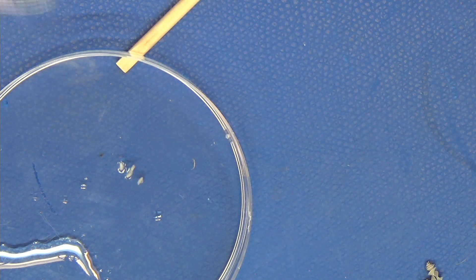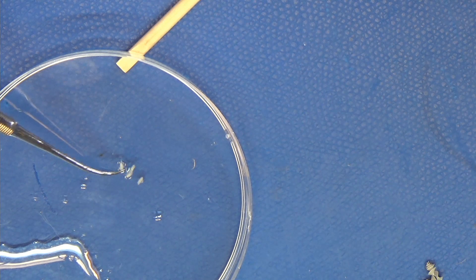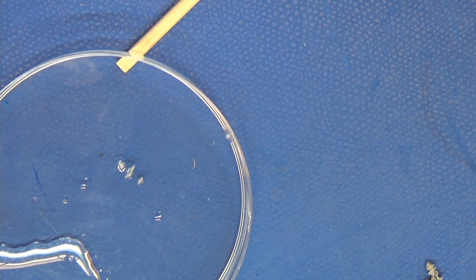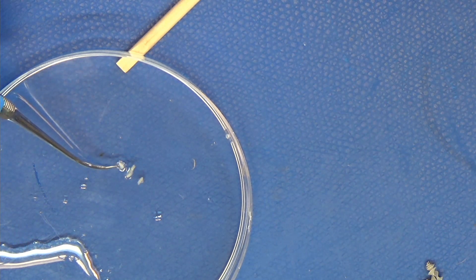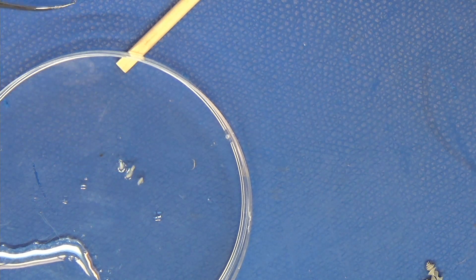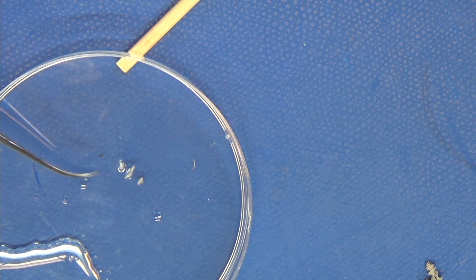I've had these root tips soaking in hydrochloric acid for ten minutes and then I've rinsed them off in a different container. This is the rinse water off to the side, and if you look at these, you can see they look a little mushier — they've been digested a little bit. So now we're going to hit them with some dye.